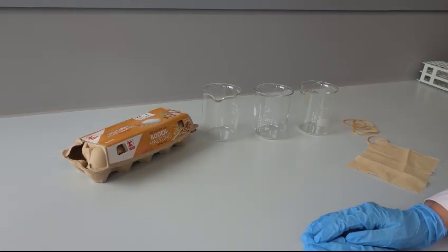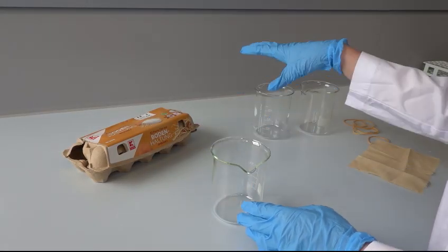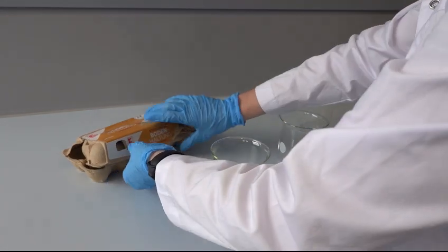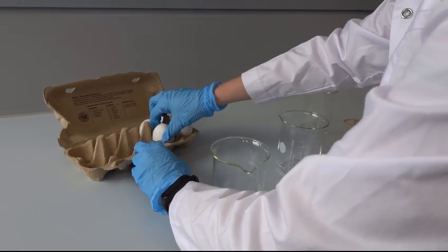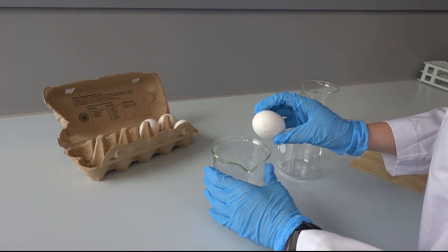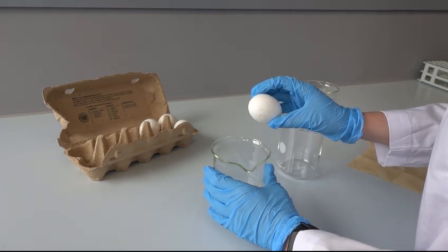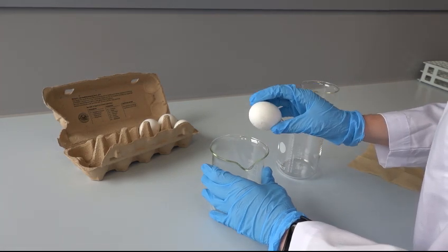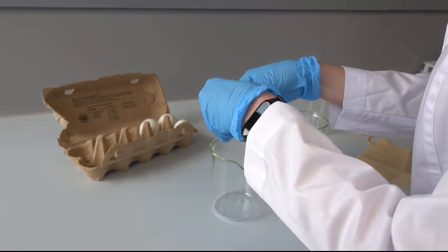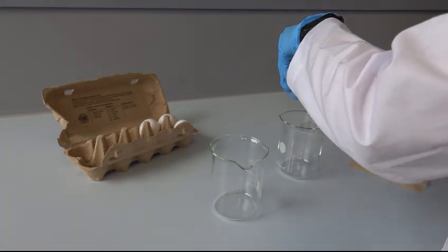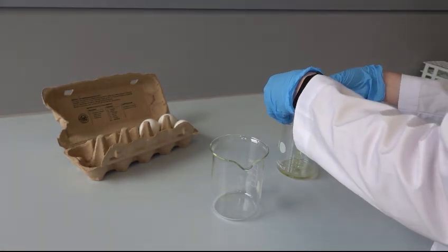Prepare fresh egg white before each course. Take a beaker and separate the egg white from yolk. The shell and yolk are discarded in a second beaker.